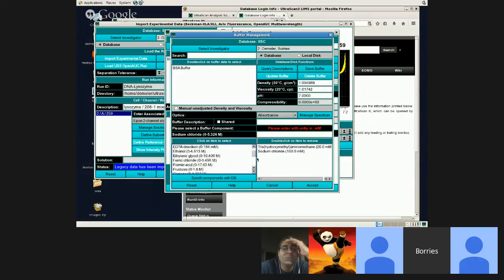Let's find EDTA. And maybe there's 0.5 millimolar EDTA. And now we have a 150 millimolar sodium chloride buffer in Tris. And maybe it was pH 8.0. Okay, so that's my buffer, and it has these things in there, and I just say save.